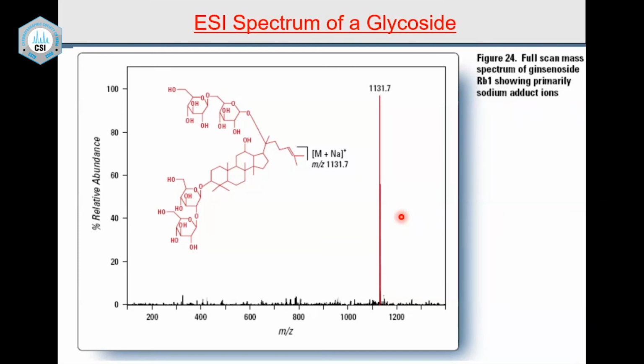It is very, very important; there is deuterium NMR also. We can substitute a proton with a deuterium and do a deuterium NMR. I'm very happy that we applied all these technologies in our research many, many years ago. All these tools are available to you today, and nothing puts us back from saying that I'm not able to do my research.